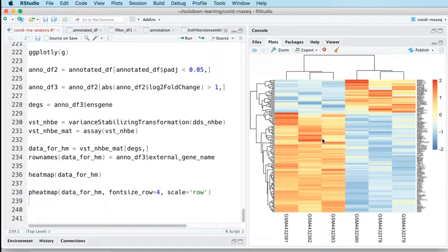I don't mind this color scale actually for this, because the row Z-score is a bit more of a diverging scale than just plain raw expression. This way of showing this data illustrates the fact that this expression here is changing between conditions a little bit more elegantly than the raw expression data does, but it's not the be all and the end all.